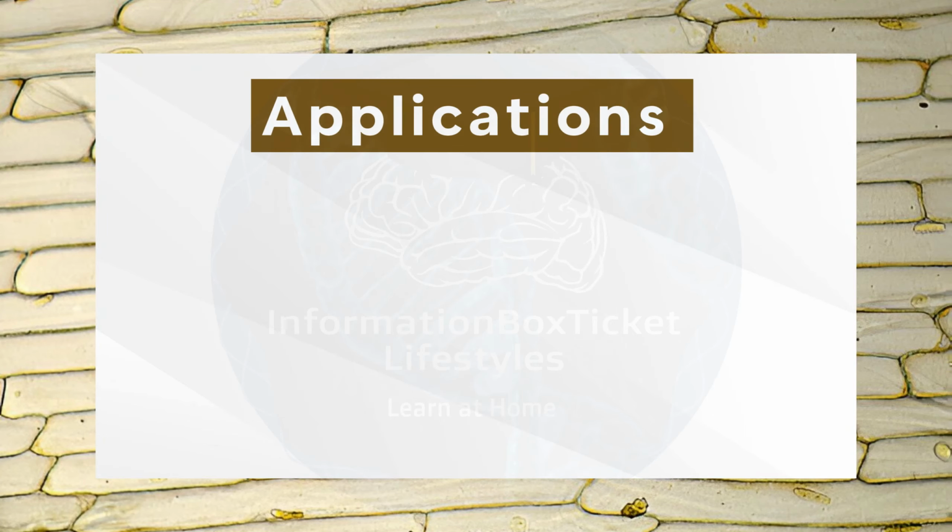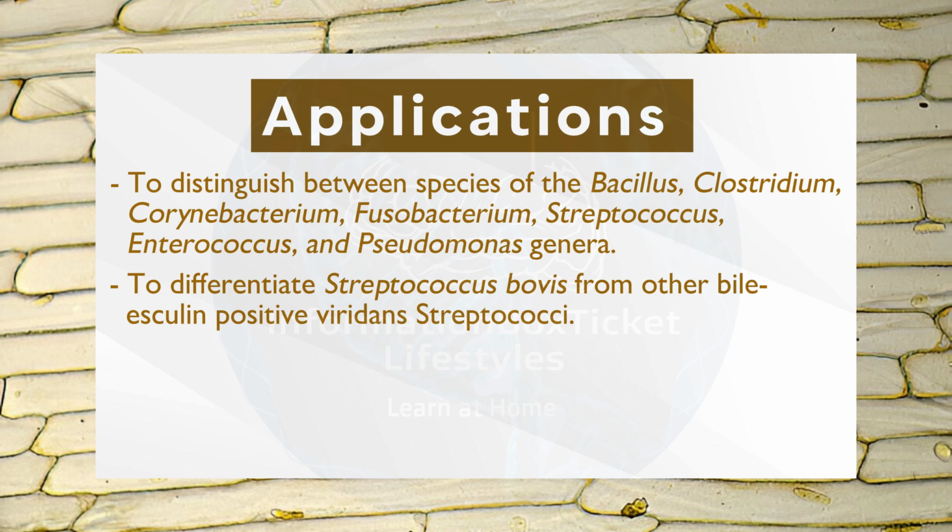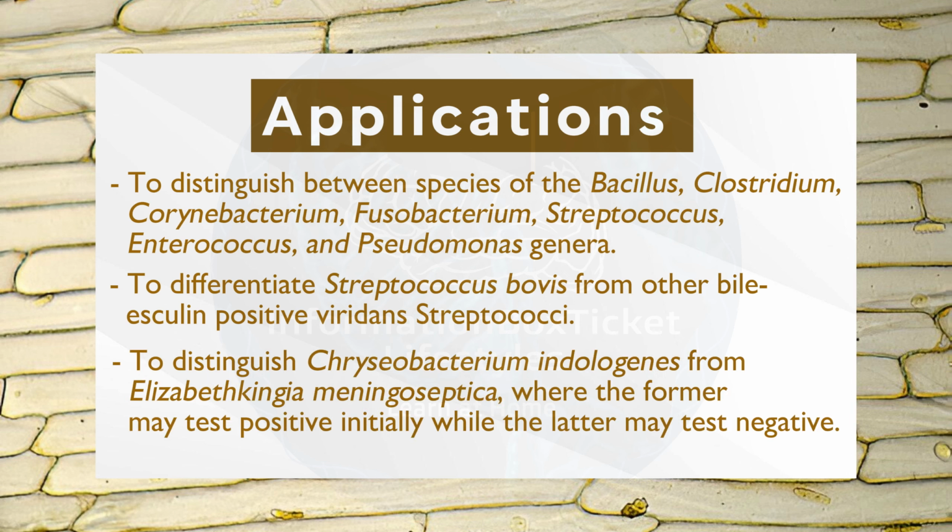Applications of Starch Hydrolysis Test: to distinguish between species of the Bacillus, Clostridium, Streptococcus, Enterococcus, and Pseudomonas genera. To differentiate Streptococcus bovis from other bile-esculin-positive viridans streptococci. To distinguish Chryseobacterium indologenes from Elizabethkingia meningoseptica, where the former may test positive initially, while the latter may test negative.